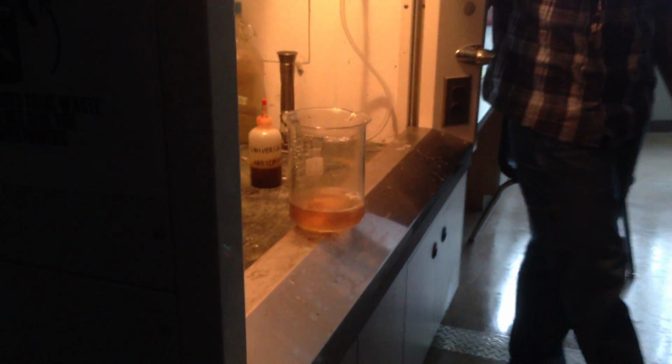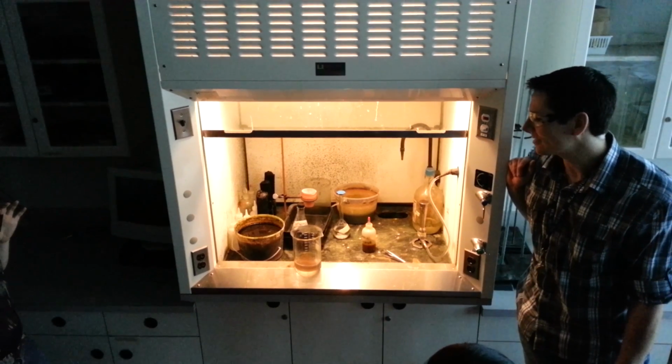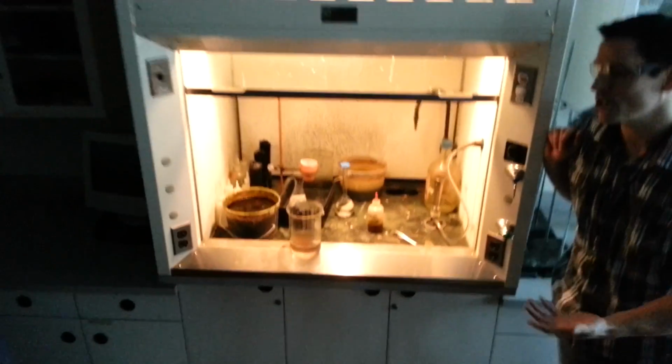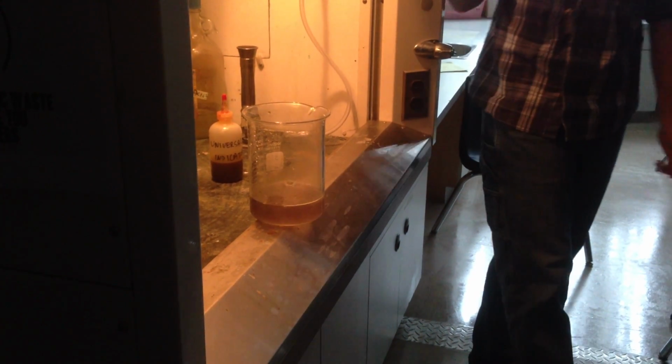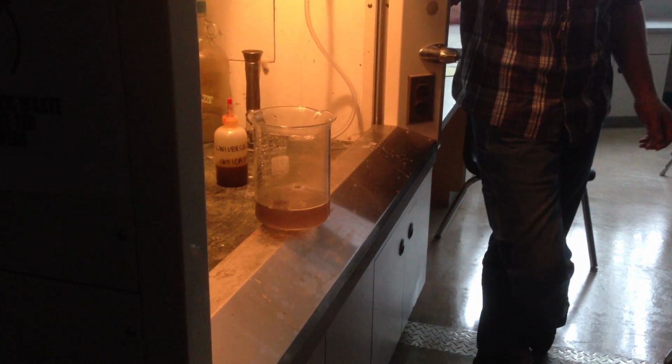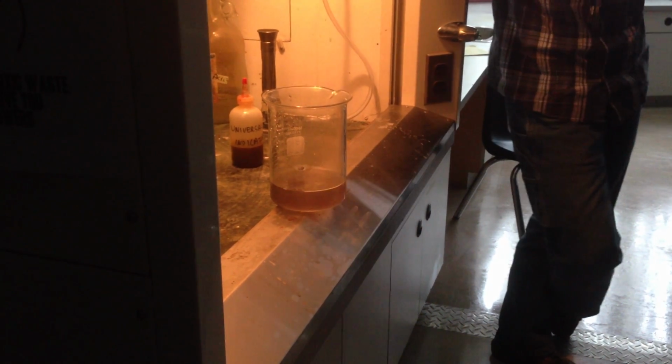It is dense enough that it should sink, but it's acting like its own little hovercraft. It's creating gas underneath it, which is pushing up on it so it doesn't sink. And the color change there, is it alkaline, basic? Yes, it is very basic. Now, that's kind of interesting.